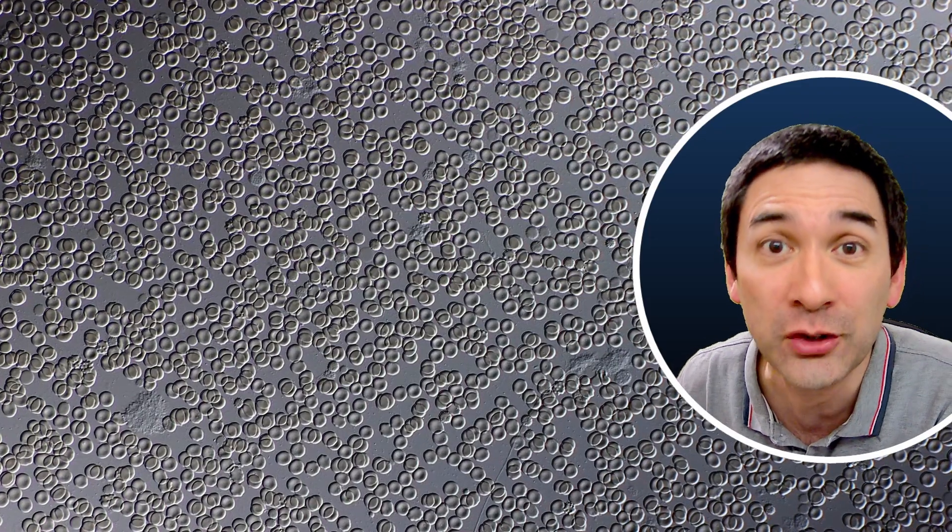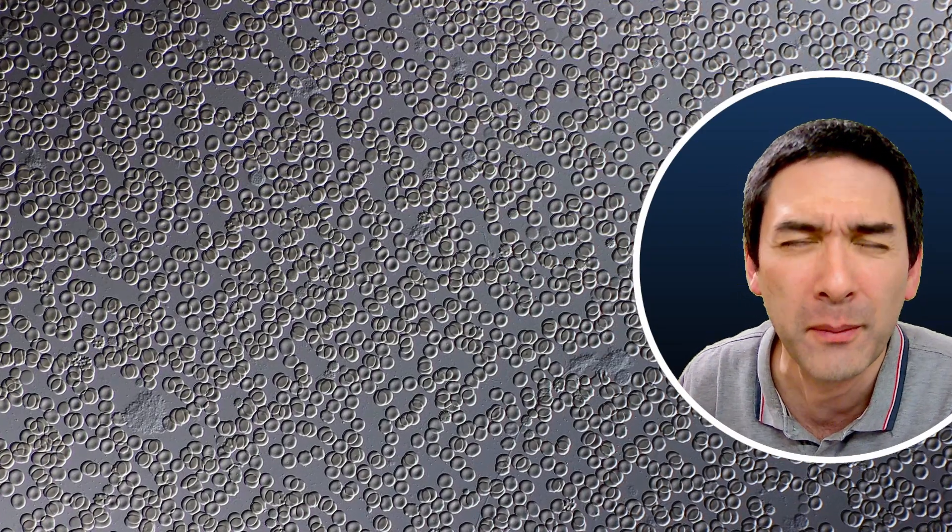I'm quite sure that you've already often heard that it is not a good idea to drink concentrated salt water or marine water, seawater. But why not?